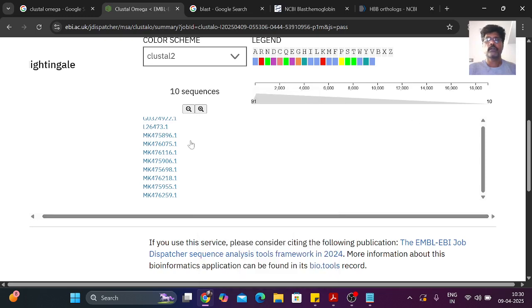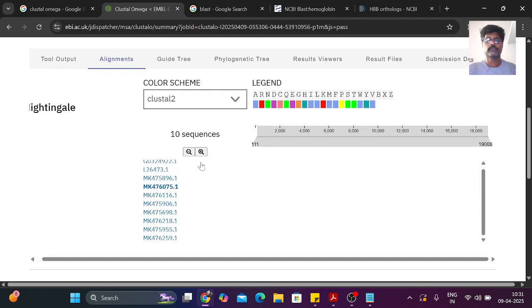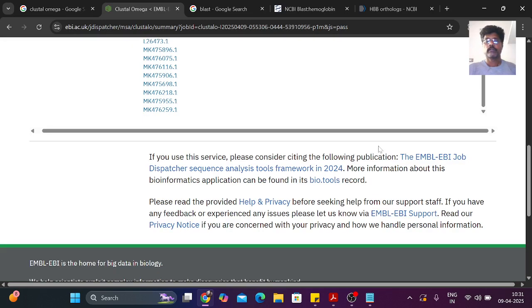So you can go for, not, I have selected something. So this is very big, so it contains... I can zoom it from here to here. So I can't find anything in this.